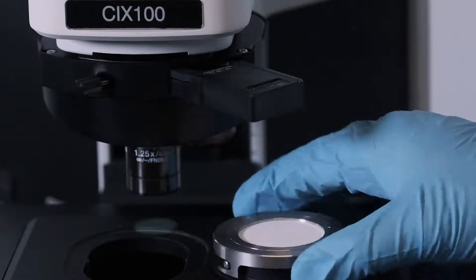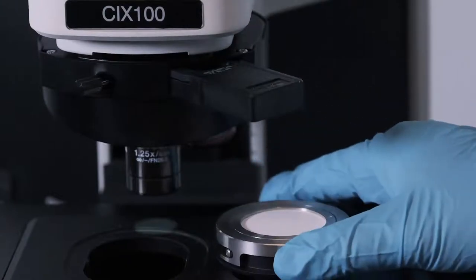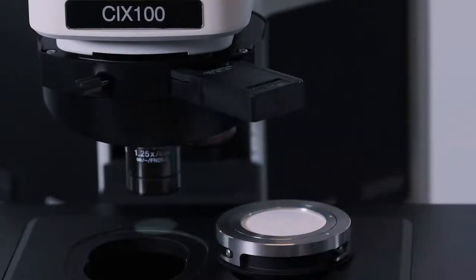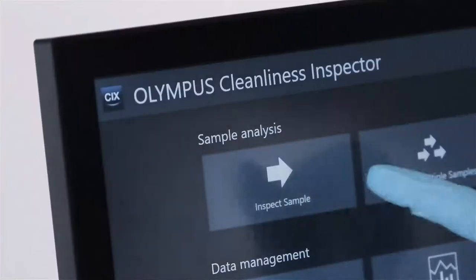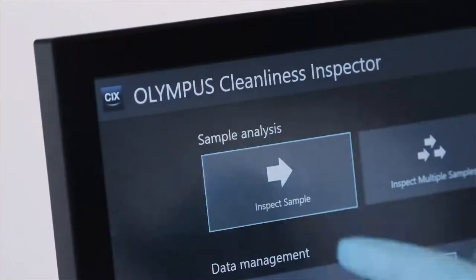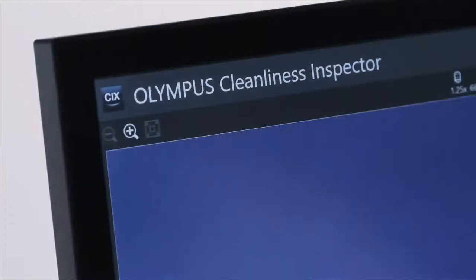After inserting the sample in the cleanliness inspector, the complete analysis is performed with full software control.